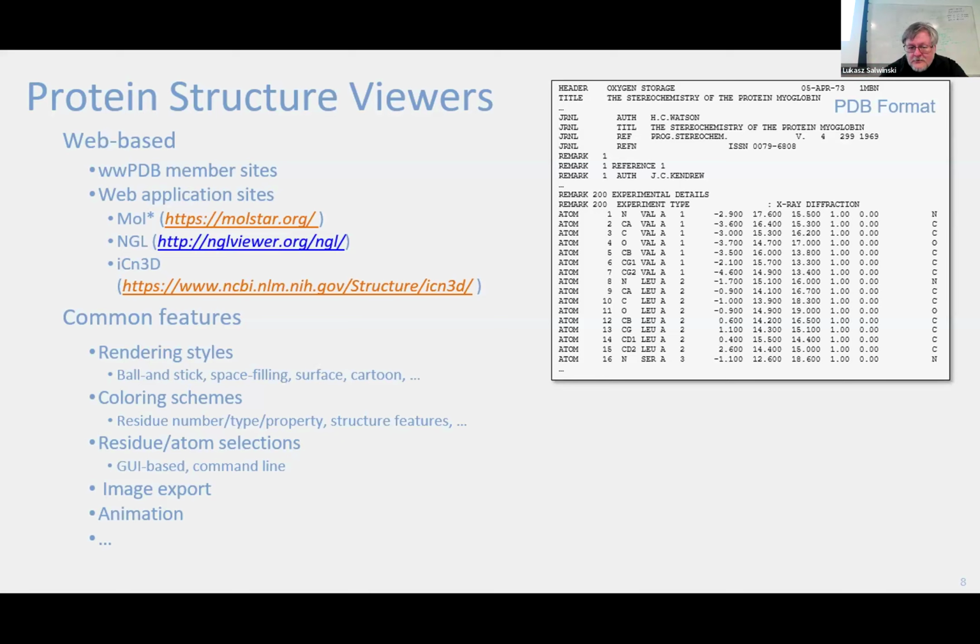So there's not enough space, for example, to have a large number of atoms numbered. So the largest number of atoms you can report in a single PDB file is, I think, 99,999, which is a problem nowadays. You've got huge complexes determined by cryo-EM, where you've got tens of thousands of atoms present in the model. So because of that, PDB is nowadays replaced by a new format called mmCIF. This one is relatively recent and flexible enough so you can report nearly anything you can think about in this format, and it's extensible so you can modify it.